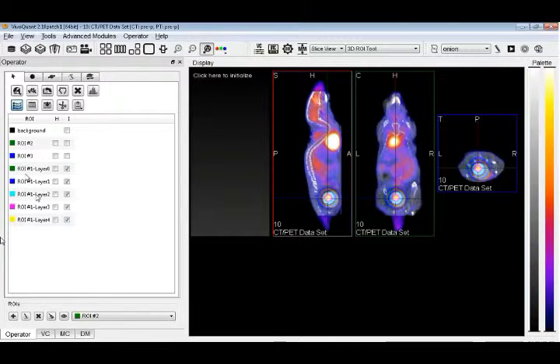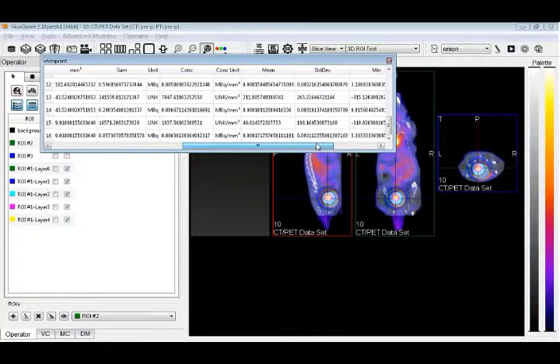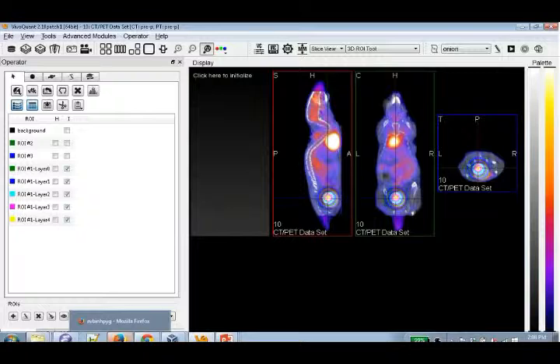So here you can see all the ROIs that were generated by the script. And if you wanted to change the way that they were named, you could modify the script to do that. The ultimate goal of the Onion tool would be to look at the signal change across these different ROIs. The way you do that would be to open up the table, and you can look at various quantifications based on the ROIs that you drew. Or you could store all of that back to the... Sure. Or write it to a CSV or anything. All right. Thanks, Fiona.